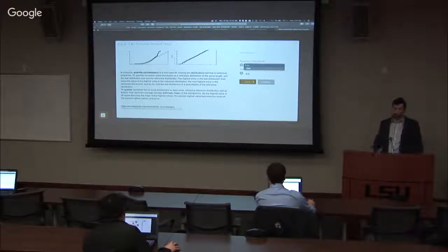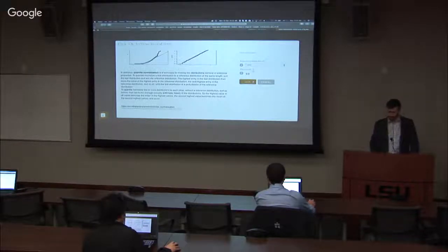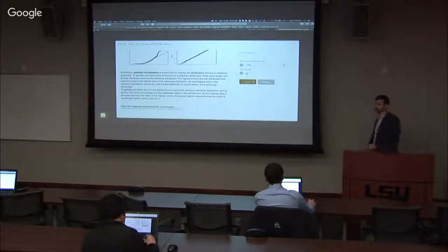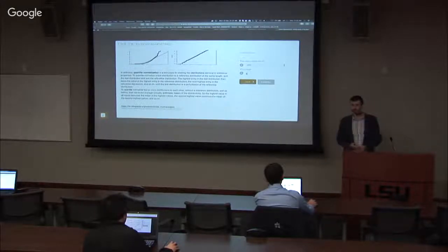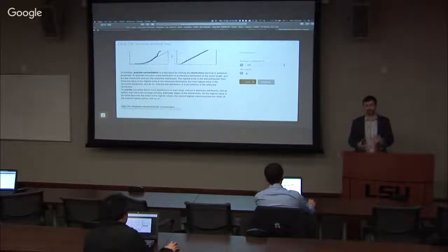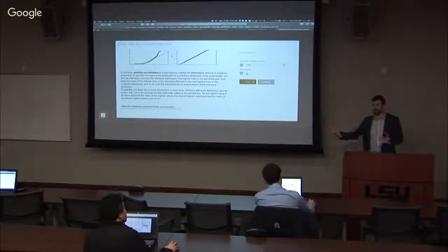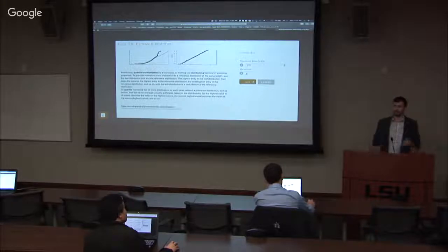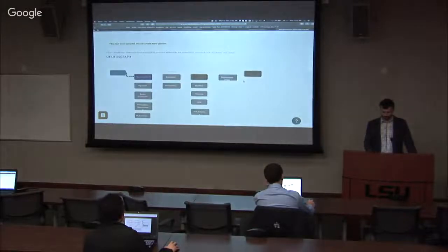But here, you also have the option to already transform this to logarithmic scale. So you don't have to do this in Excel or manually. So you can just go ahead and press yes. And here, you can set the threshold to be 5. Now, what will happen if you don't do a threshold? It will be exactly the same. So if you don't do any threshold, then your output file still contains some variability inside, but much less. And if you do the threshold of 5, it's going to actually leave everything above 5 to be more comparable. So you want to focus on that signal.